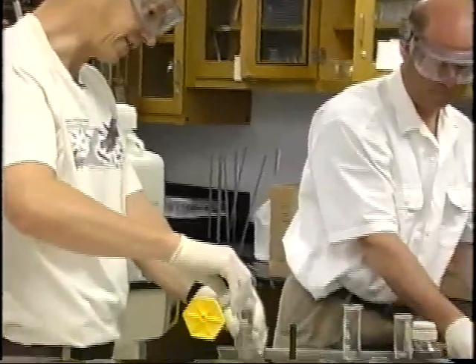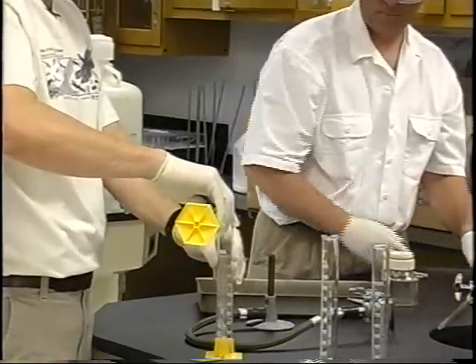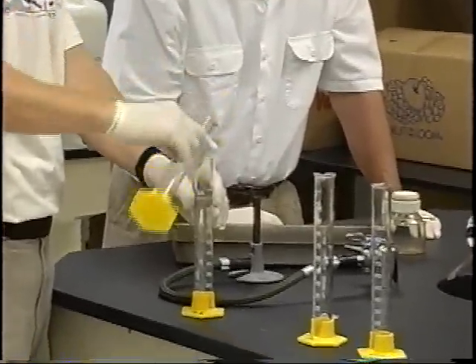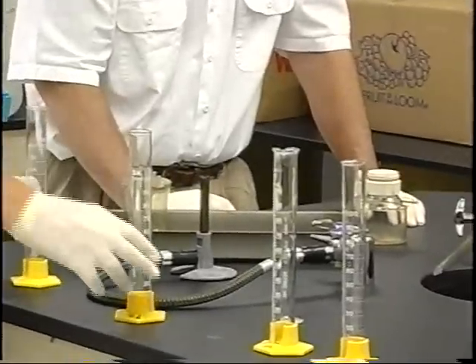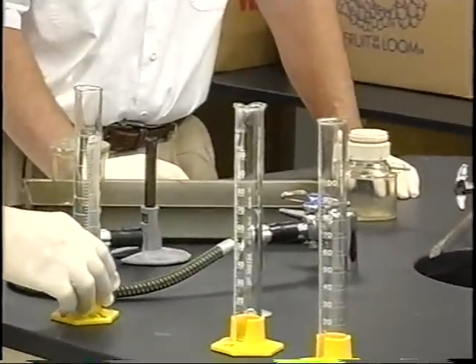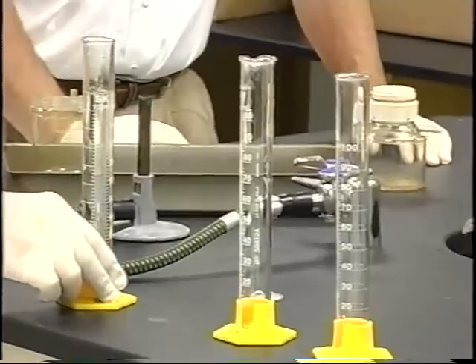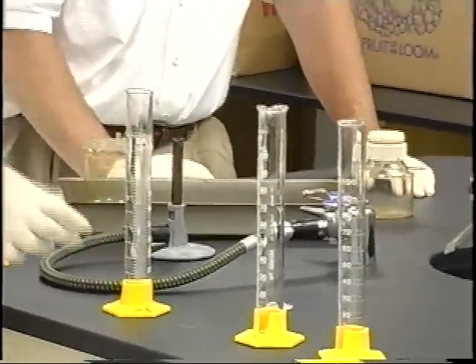If I mix this, like I said a moment ago, I've got 110 mLs of water. 10% of this is river water. The rest is deionized water. There's enough bacteria in here probably to give me a good result. You'll see colonies of bacteria growing out of here. Even though you can't see them, we know they're in there.